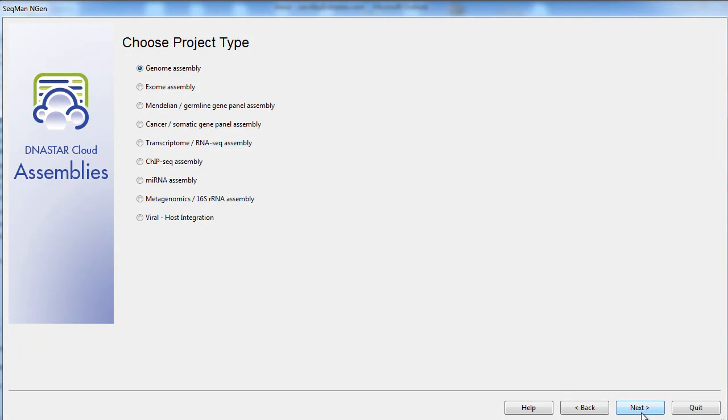Next, we'll select our project type. Again, for this project, I'll be doing some bacterial genome assemblies, but you can perform any of the assembly projects from this list.